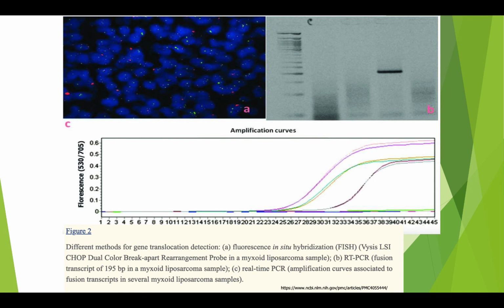I'm leaving this for you just to look at different methods for gene translocation detection. For example, we will talk about it in an upcoming lecture. Here, this is an RT-PCR of fusion transcripts of this liposarcoma, and then real-time PCR amplification with several samples.